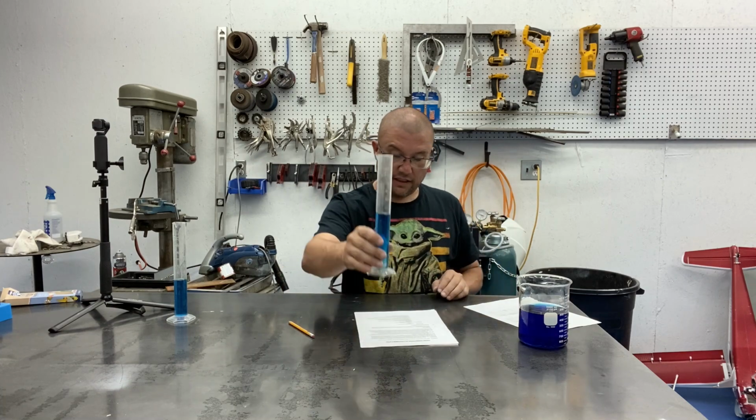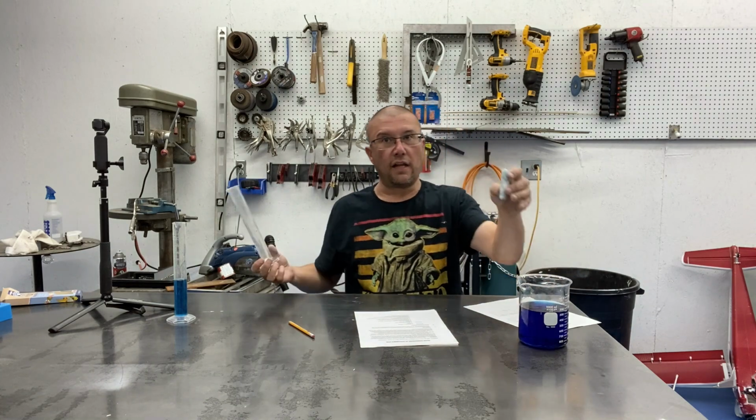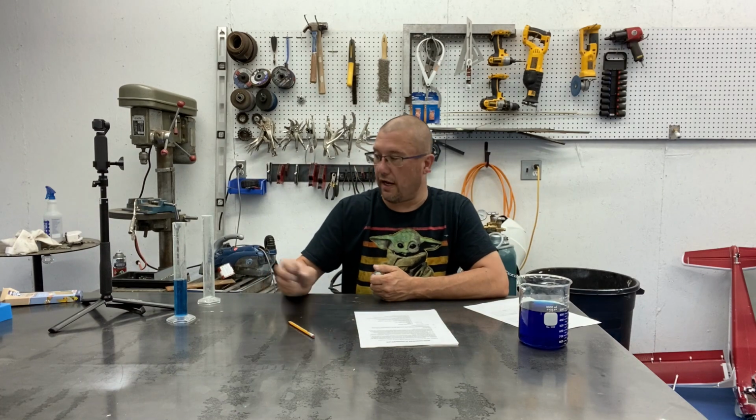Step 9, take the clay out and empty the graduated cylinder. I'll pour it back in our bucket of water and get our clay out. We've got our clay now. And then it says repeat steps 3 through 9 two more times.